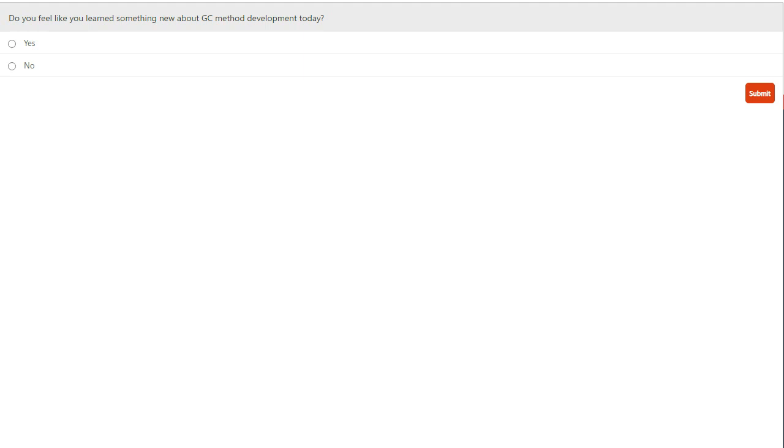Thank you. Next question: when would a standard GC method be more appropriate over a fast GC method?